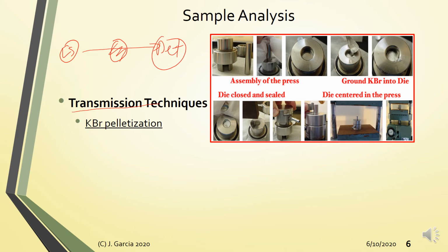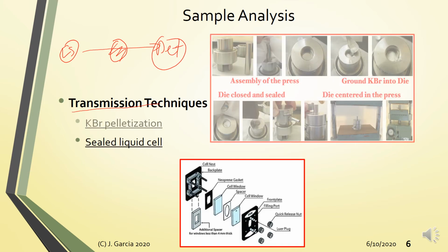Okay, so saan ginagamit ang KBR pelletization? Usually this is for solids. Okay, solids na hindi hygroscopic and can be molded into a pellet. Okay, yan. So next, you have your sealed liquid cell.